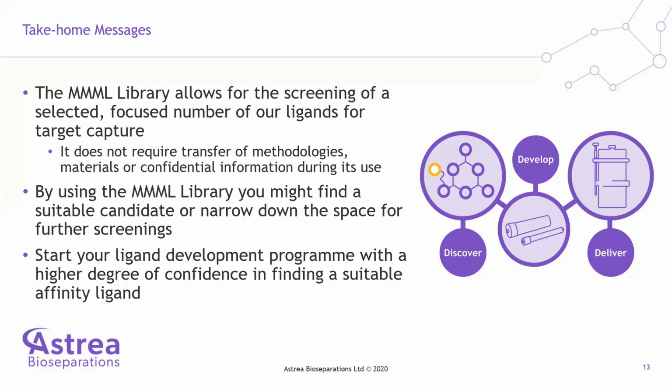This is a library we designed to give somewhat of a flexibility, cover a large chemical space, but it has restrictions in terms of size. It has, at the end, 64 combinatorial ligands plus a few bis ones.